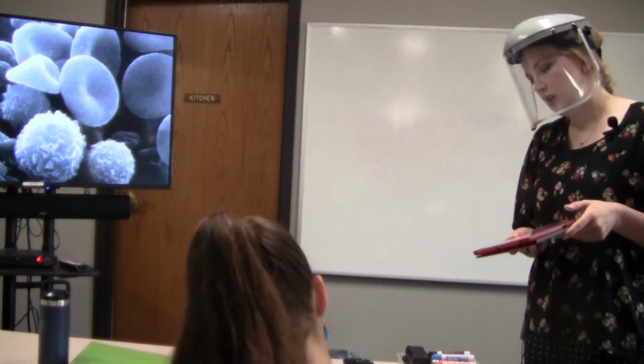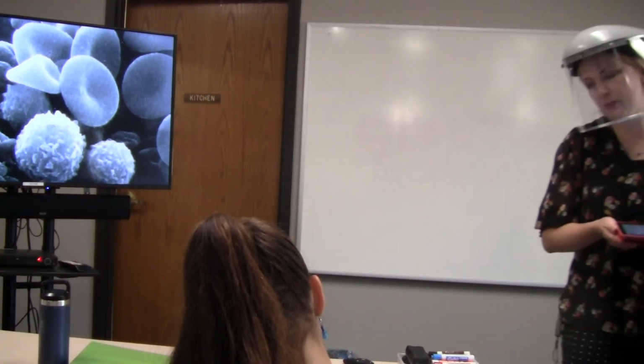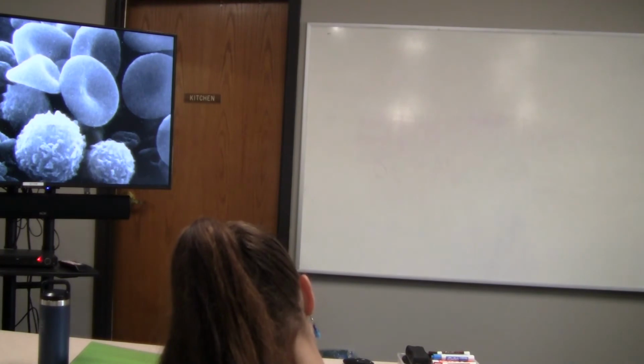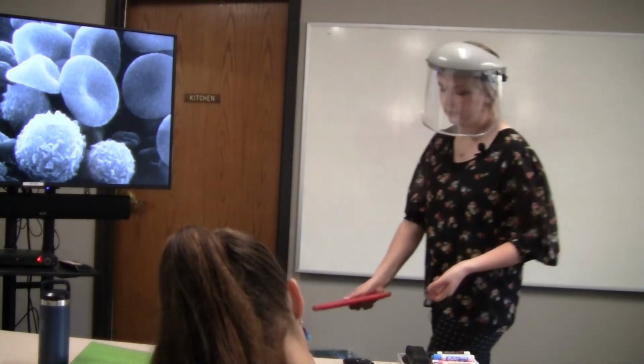And then, last one. The small platform where the specimen is mounted for examination is the stage. So those are the pieces of the microscope.